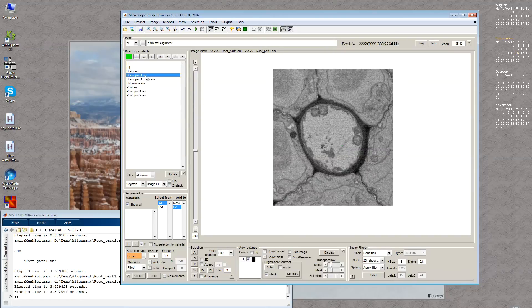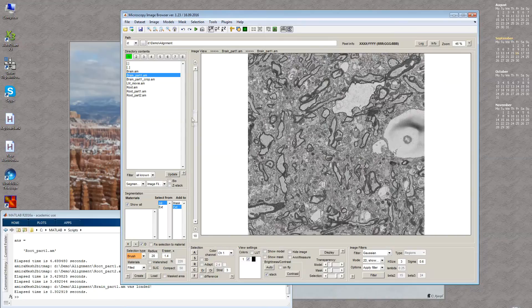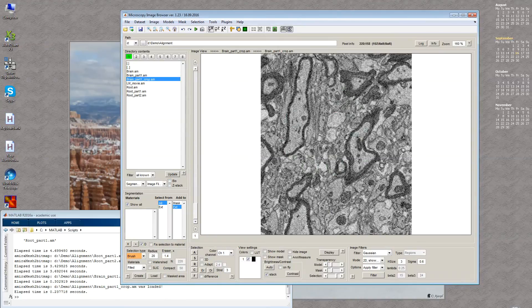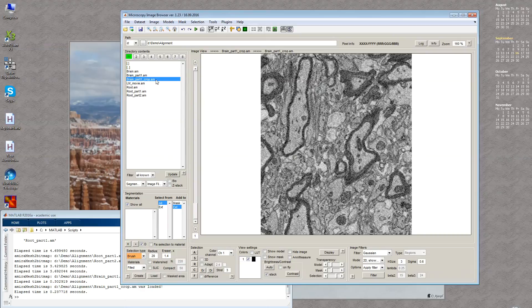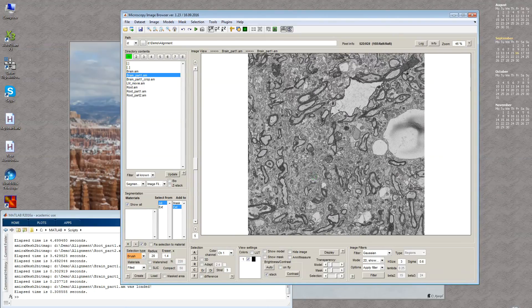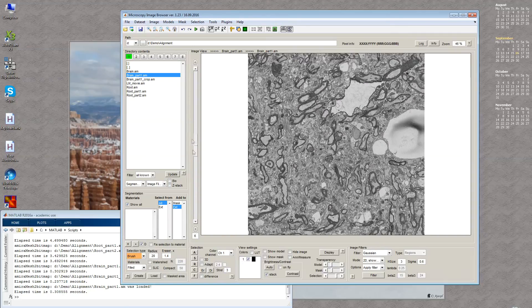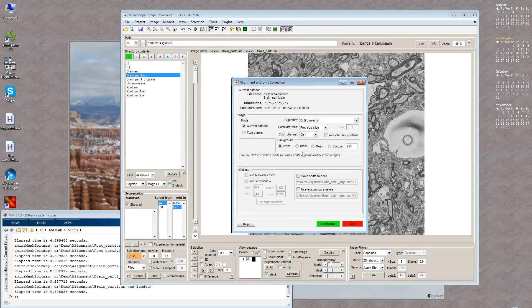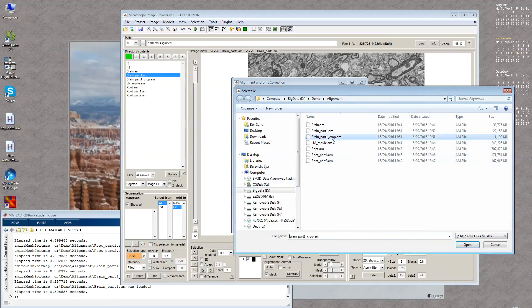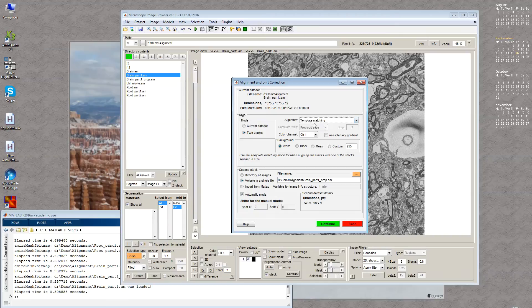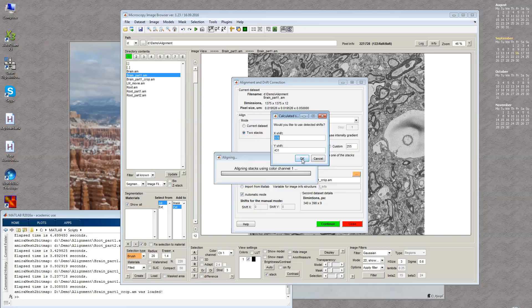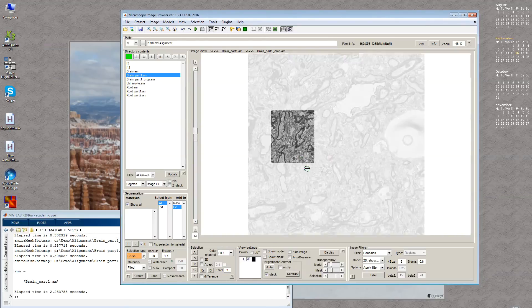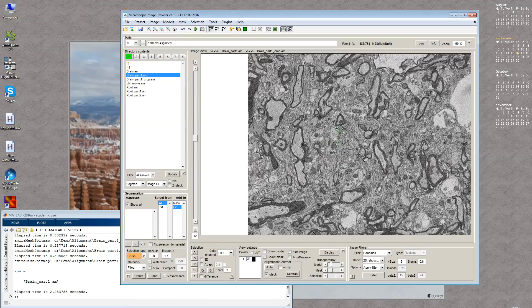If one dataset is quite big and another is a small subfraction of the bigger one, we can also align them together using a different mode. This is the bigger dataset, then I go to Alignment Tool, Stack mode, Volume in a Single File, and select the second part. Drift correction won't match them, so we use Template Matching mode with white background and continue. These are the shifts. Now if you look, this is the second part and you can see it was matched nicely to the bigger dataset.